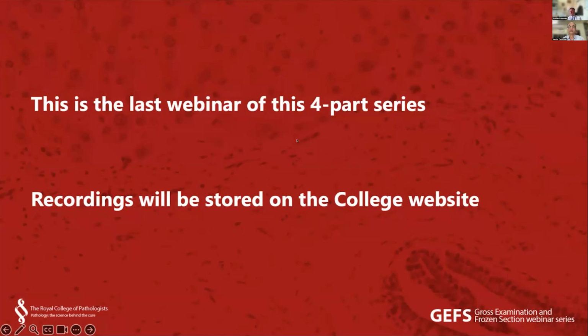The tumor bud is a small collection of tumor cells, up to about 4 cells in size, that is present just at the leading edge of the tumor.